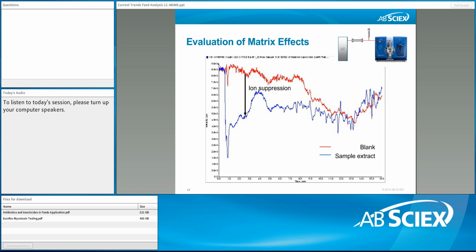And one very important tool to minimize or maybe even eliminate ion suppression effects is dilution. I mentioned that earlier already, that the QuEChERS extracts are typically diluted. Dilution reduces ion suppression effects, and then we have to find typically the right dilution factor best matching our matrices to ensure that we do not have too much matrix effects to report incorrect quantitative data.